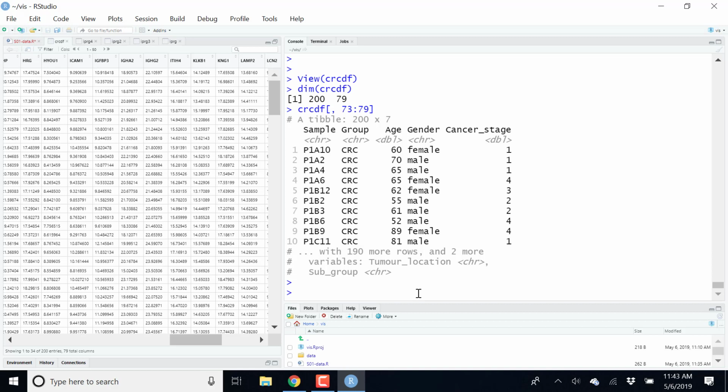So for example, this first feature here, we have quantitative values for all of our samples, but I would like to have its identifier, UniProt identifier, for example, maybe a longer description of that protein, if it's a protein. Maybe I would have some information about the gene ontology for that protein. And for example, something that we'll calculate later on, we might also have a p-value.